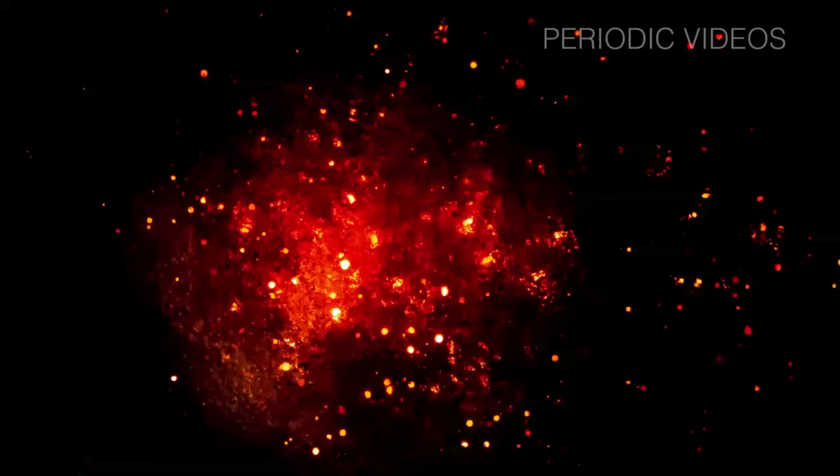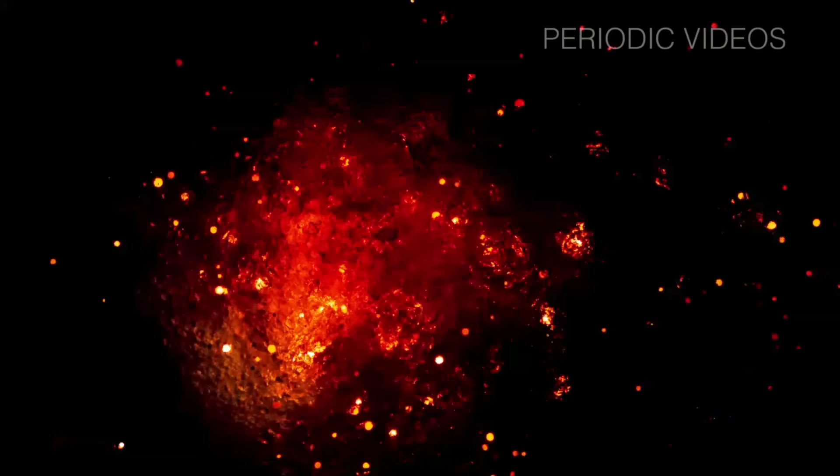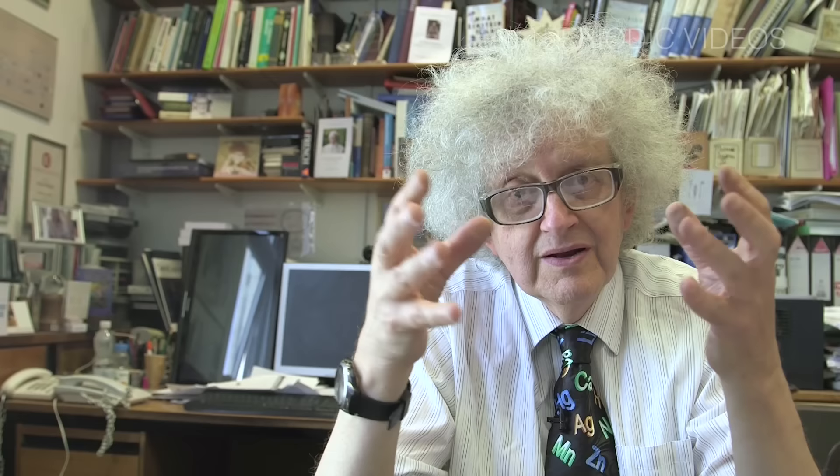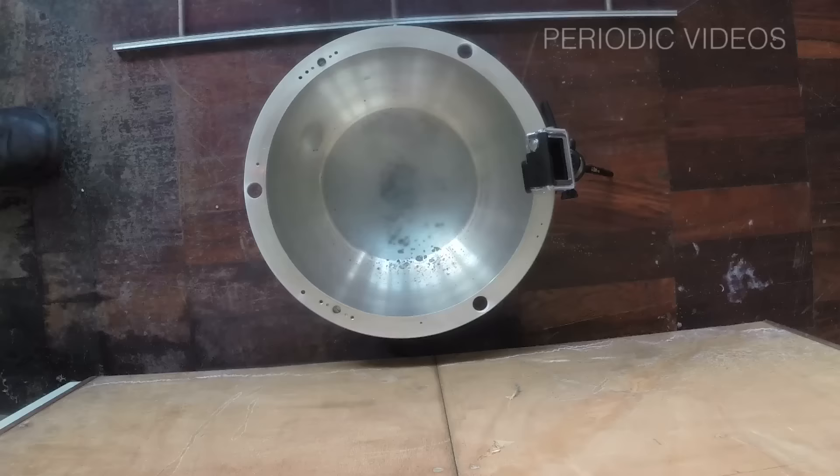The obvious interpretation, if you see these pictures, is that somehow the iron is burning in this really cold liquid. But that's a contradiction. How can something be very hot and very cold at the same time? Now, what I thought was that the iron was so hot that it was effectively in a bubble of oxygen gas, which was bubbling up all the time, but was able to sustain the combustion.